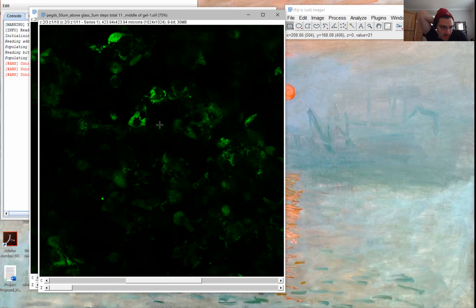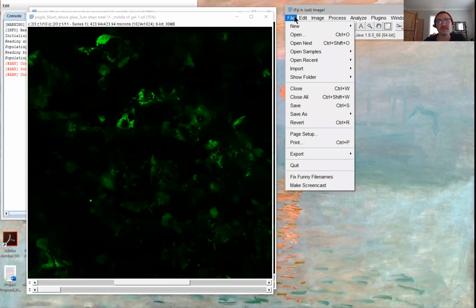If you insert a PNG or a JPEG, you can't do nearly as many functions, like the channel tool and the Z-stack, with your images. It's a lot harder to do. So say you manipulate this duplicate and want to save it for later. This is the only time you can press save, and then rename it something like duplicate, copy, or manipulated original.